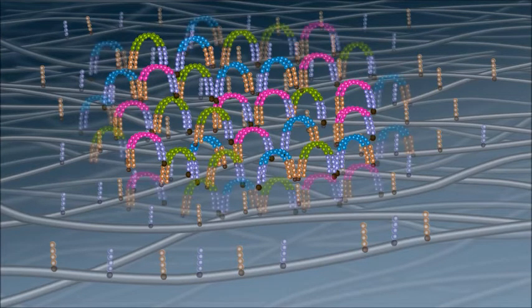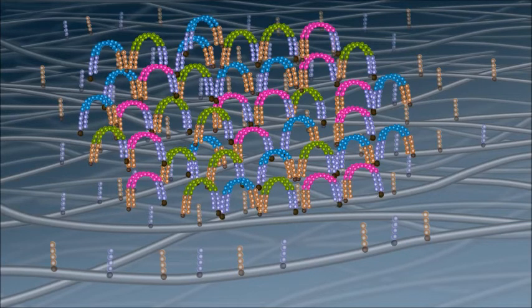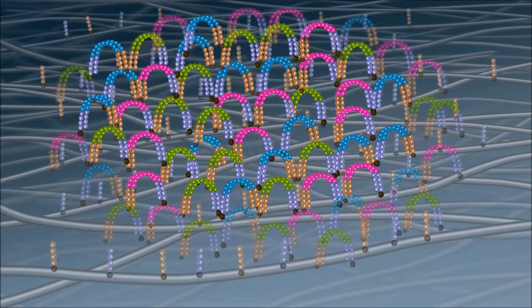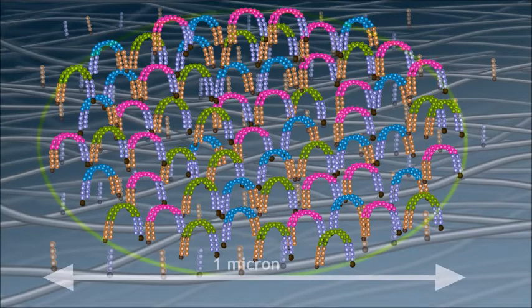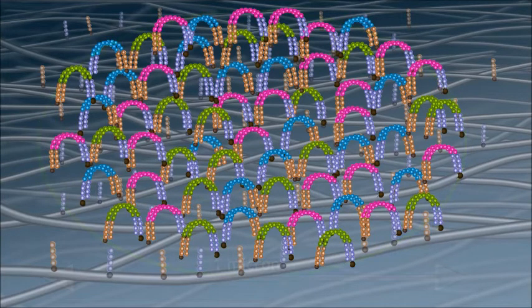These DNA clusters, known as polonies or polymerase colonies, can get amplified to greater than 100,000 DNA molecules per cluster, providing bright fluorescent signal for sequencing. The size of these clusters is typically around 1 micron in diameter. In the case of multiple barcodes from a protein complex, they will be amplified into spatially colocalized clusters.